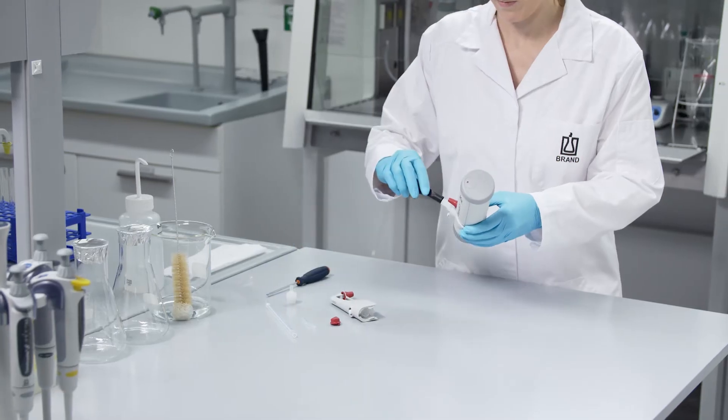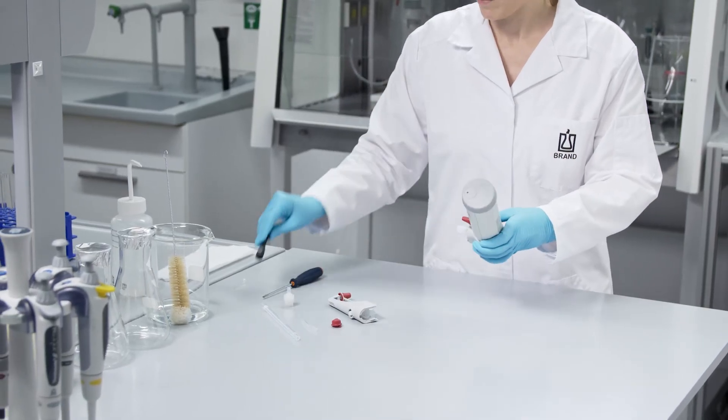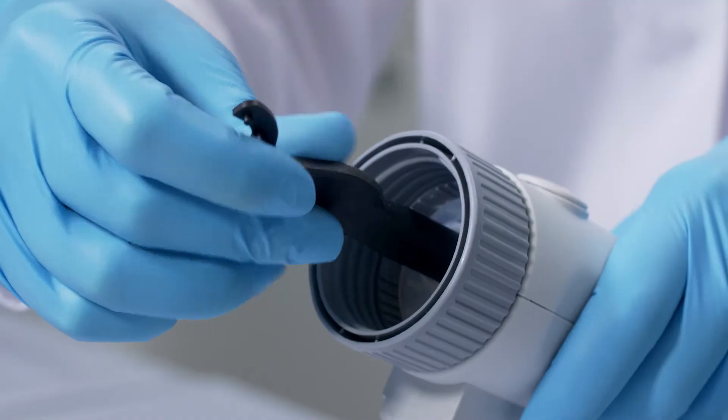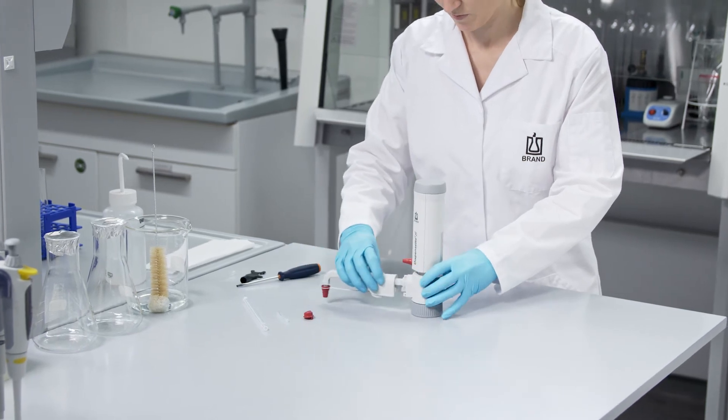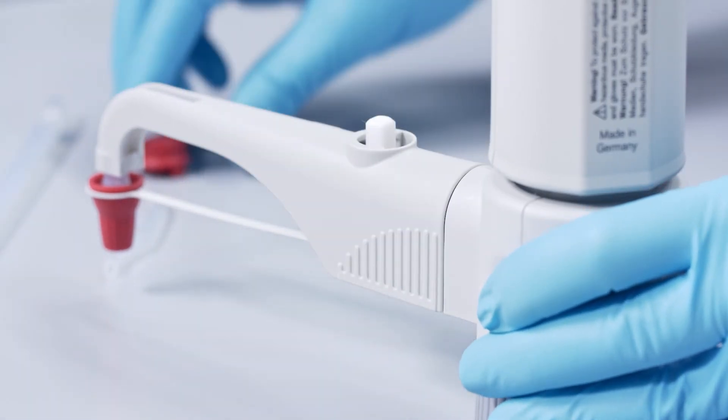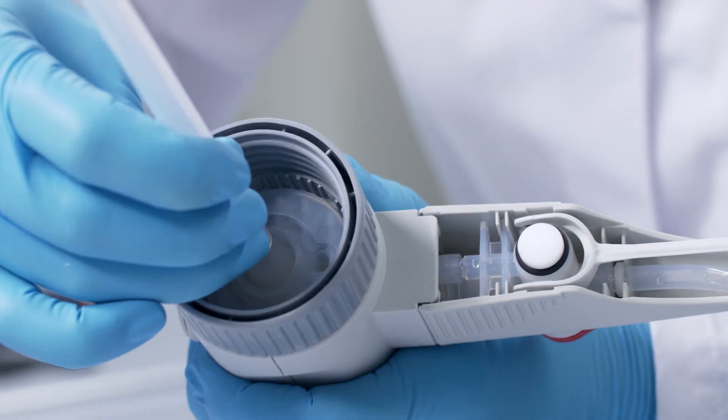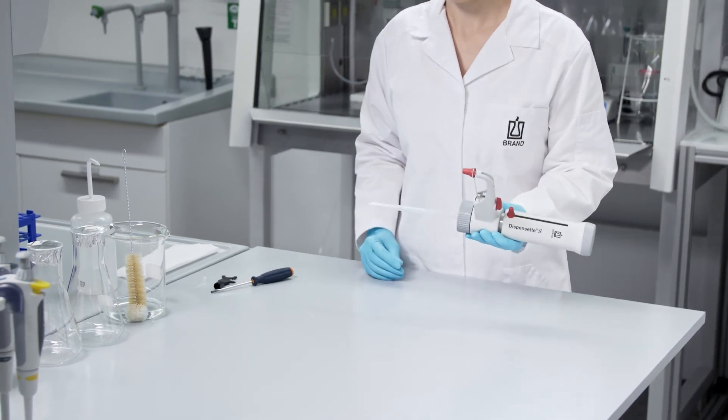Screw in the valves using the mounting tool and attach the discharge tube. Then attach the filling tube and the optional recirculation tube. Your Dispenset S is now ready for use again.